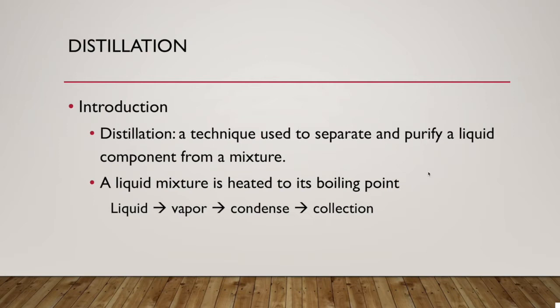So basically, distillation is a technique used to separate and purify a liquid component from a mixture. This liquid mixture is heated. Basically, we're just heating that mixture to its boiling point. Once the liquid boils, its physical state changes from liquid to vapor.